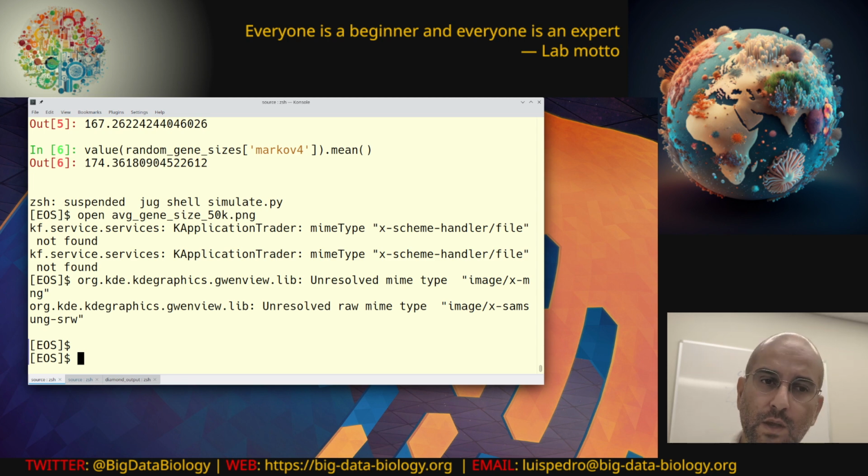Is it because you have messed up genes, but it's still okay? So if you have a gene that's 200 amino acids, and now we've somehow cut down the last 50 of them, maybe the first 150 are still good enough for checkM2 to say, oh yeah, this is the blah blah blah hydrogenase. Or we'll try to look a bit more into those kinds of questions.